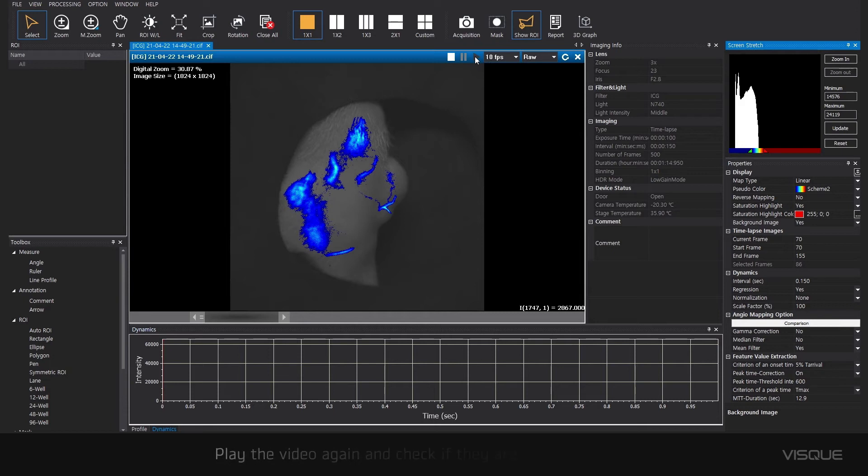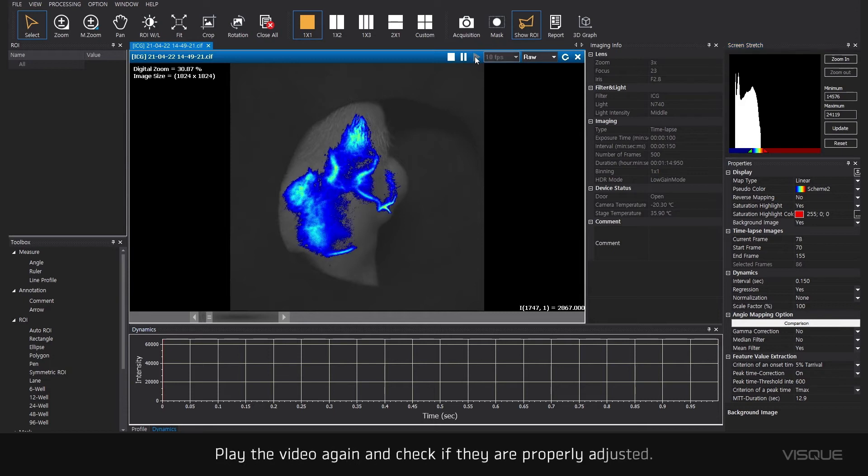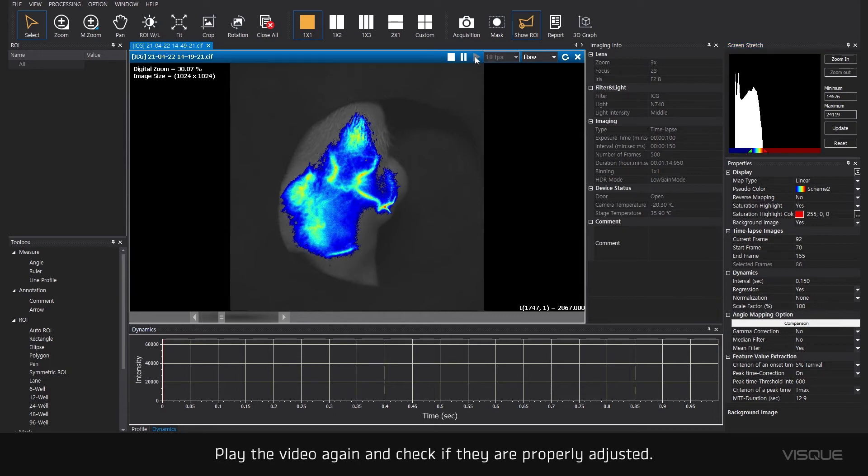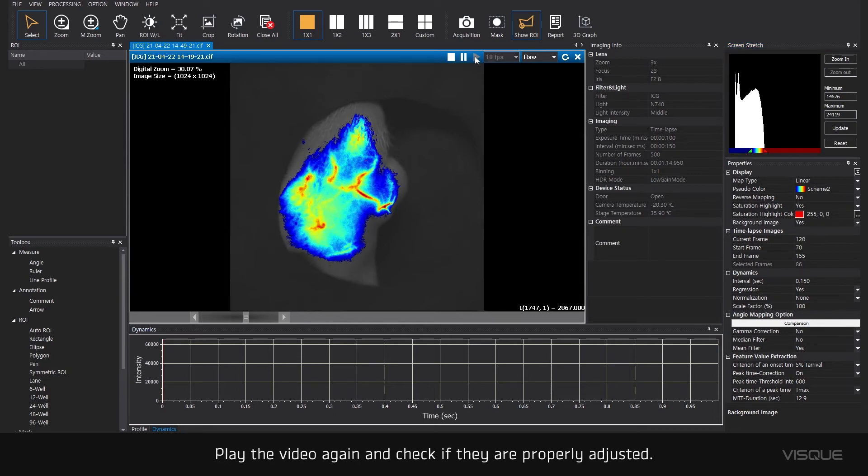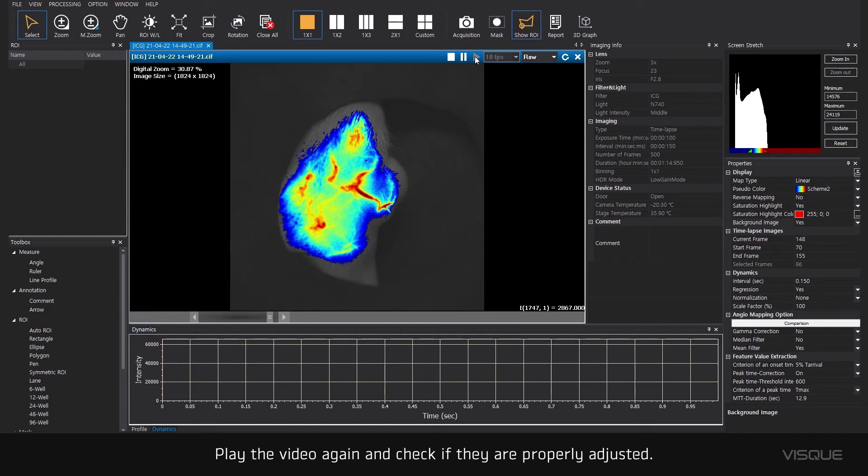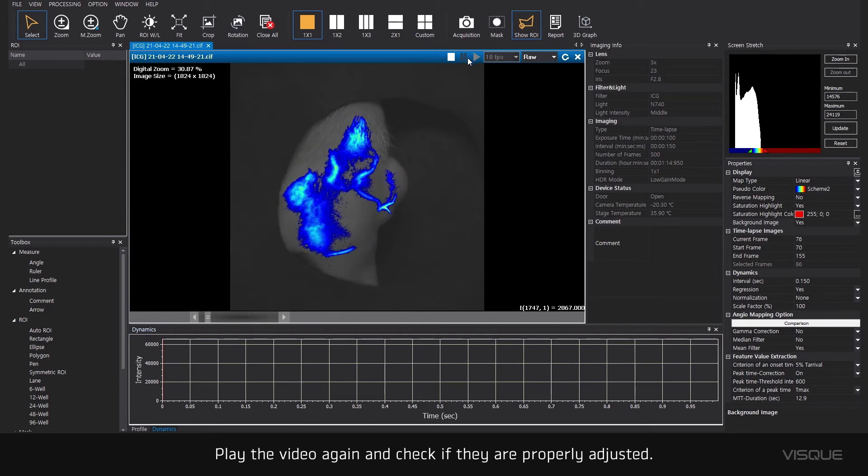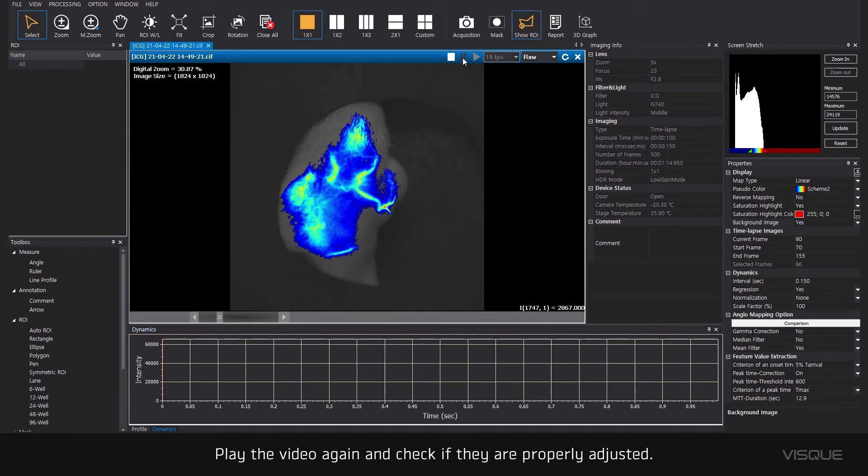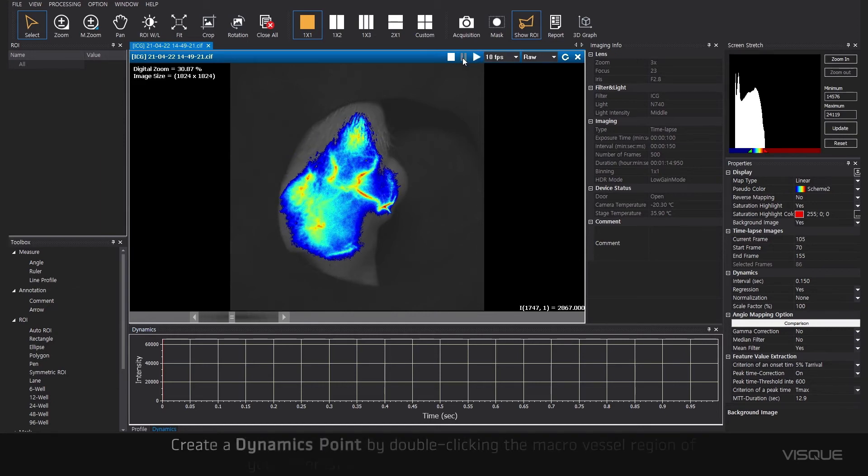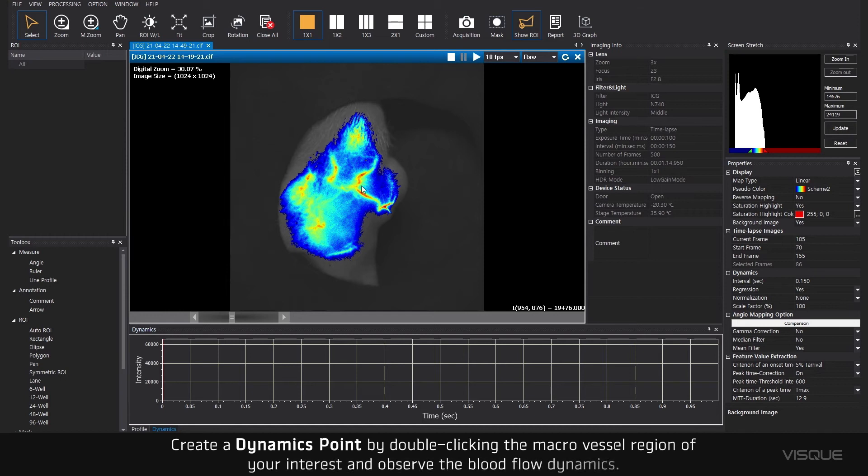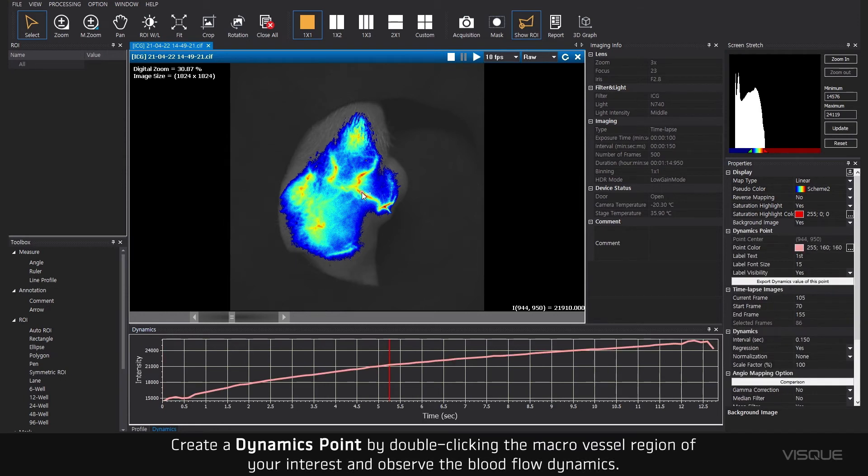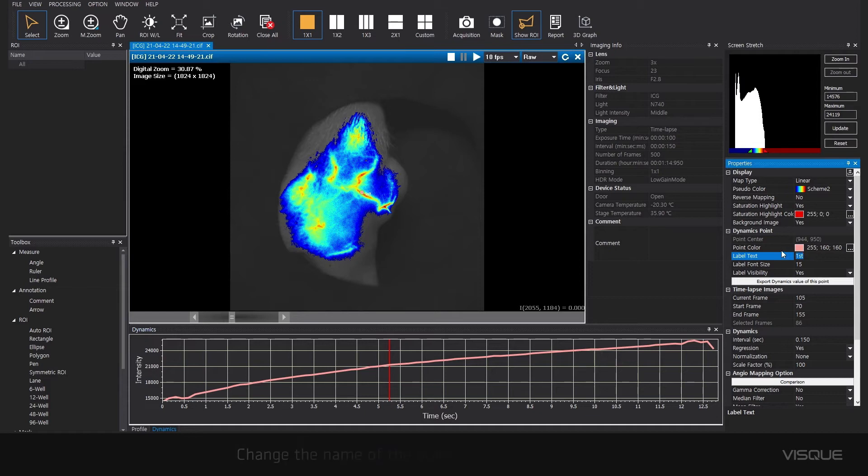Play the video again and check if they are properly adjusted. Create dynamic point by double-clicking the microvascular region of your interest and observe the blood flow dynamics. Change the name of the point and adjust the text size.